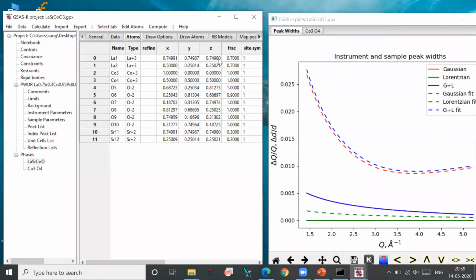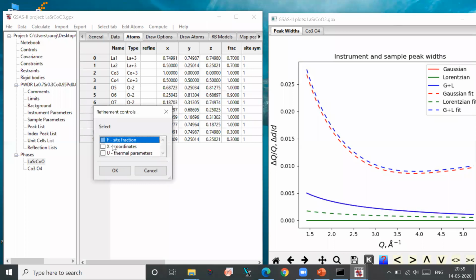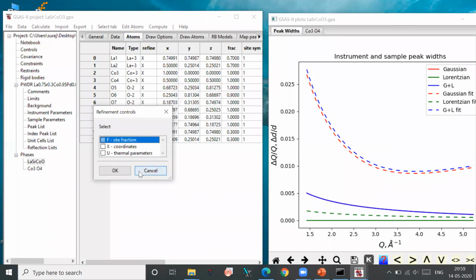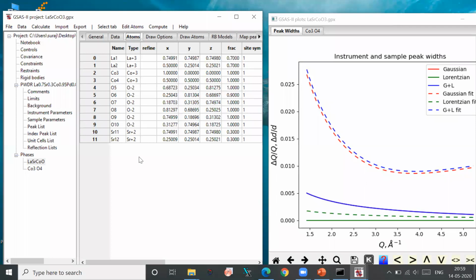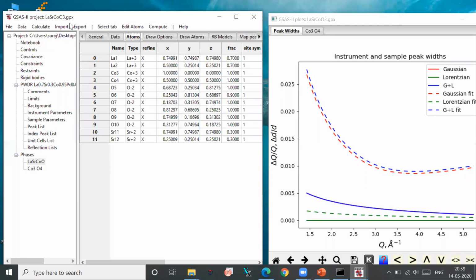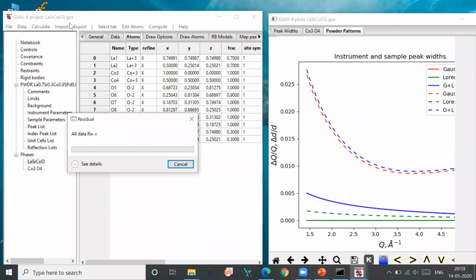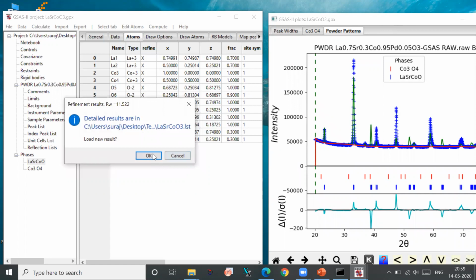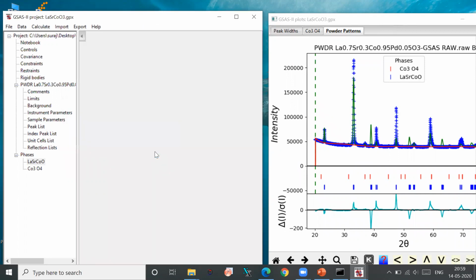Okay, so you have to refine this fraction. You can refine it automatically by giving a command to the software, like, I want to refine the coordinate here. See, refine, double click, okay, coordinate. Okay, so now refine it, but what will happen, let me show you. So it will automatically refine the coordinates, but all the time it is not fruitful.